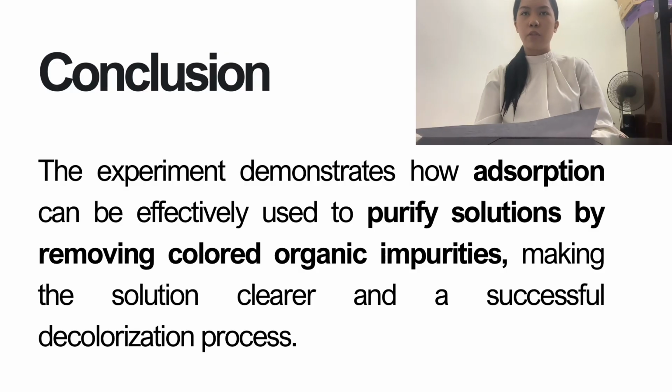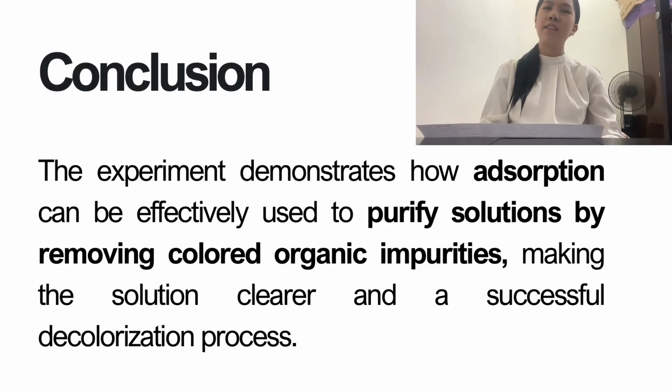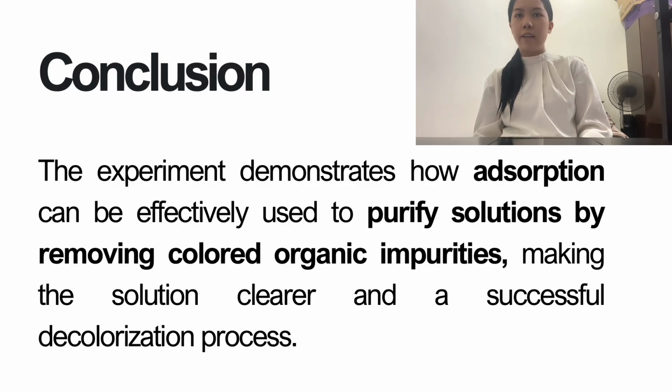So in conclusion, the experiment was a success and it was all as expected. The results are achieved. The experiment demonstrates how adsorption can be effectively used to purify a solution by removing colored organic impurities, making the solution clearer and a successful decolorization process.